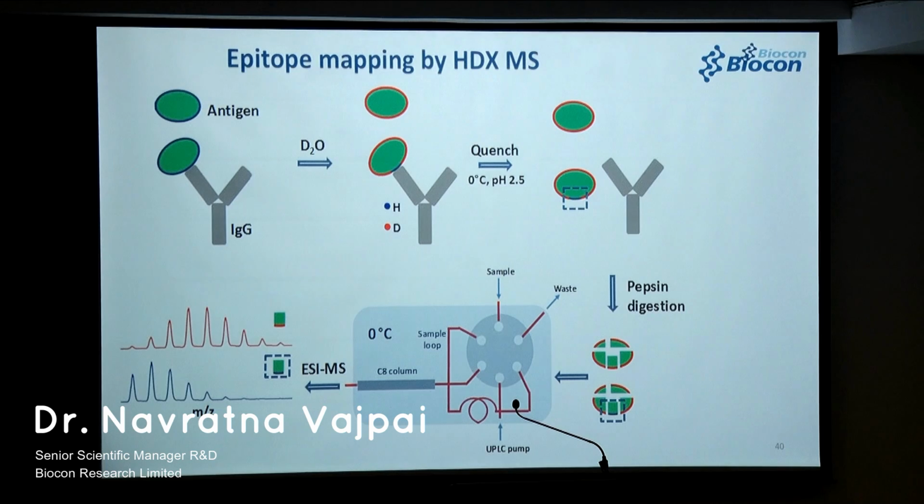Of course, yes, NMR can provide this, but one challenge with NMR is still there, and that is the right assignment of the peaks coming out of methyls. For insulins, it is quite easy because it is a small molecule, you can run multi-dimensional experiments and get that information. For mAbs, that is not easy, that's not trivial. So you actually have to identify a new technique, and that's where I think HDX-MS has an advantage, that you can go to residue level without labeling also.